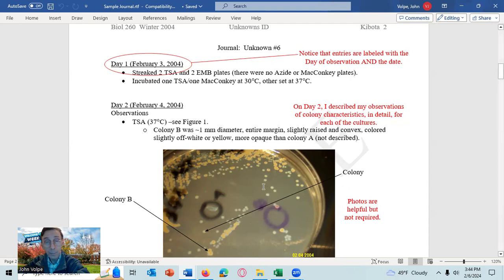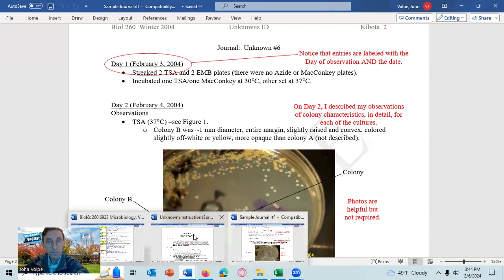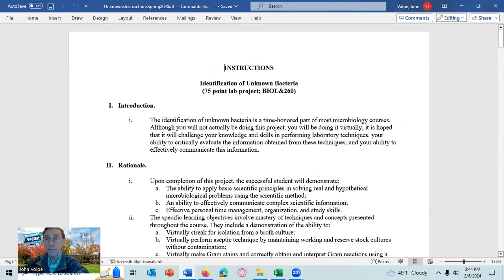You then will grab from that second colony to set up your stock culture, and you're going to pretend that all the tests that you're running are coming from your stock culture set up from cells that went through 2 colony formation events. And we actually have that, how we did that in the lab with your unknown instructions near the bottom.